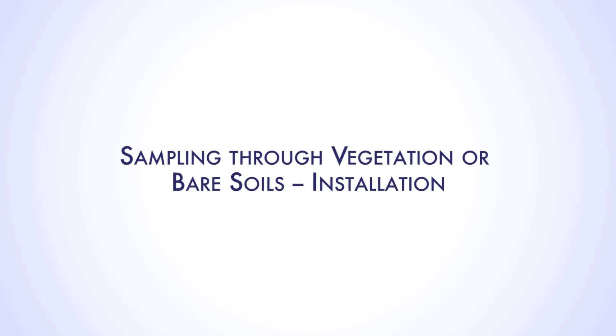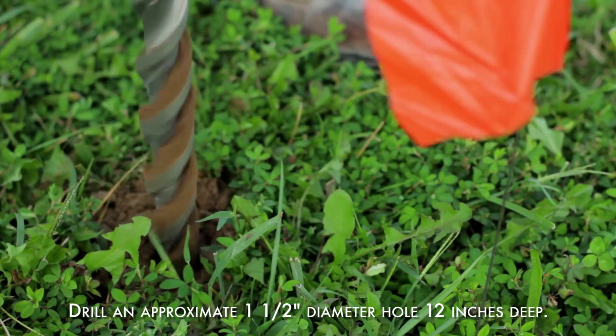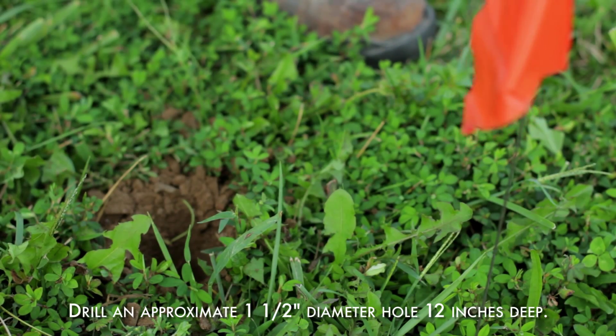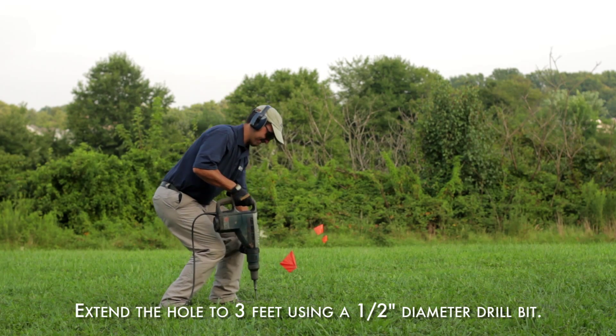When sampling in soil or vegetation covered areas, clear vegetation and debris as necessary and create an approximately one and a half inch diameter hole twelve inches deep. Then, using a half inch diameter drill bit, extend the hole to a three foot depth.